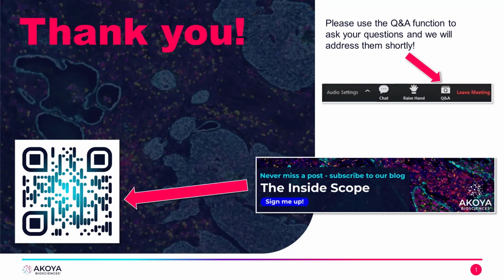Can we quantify expression of markers? Yes, so you're able to look at not only how they're expressed, but also relative expression. If you look at how the output is done, you not only get your relative data in terms of your X and Y, which is lost in a lot of other types of analyses, but you're also able to see what the relative intensity is of your different markers across your different cells. So in the example I gave during the talk, we had 63,000 different cells, and you're able to get your expression for each of those cells, for each of the 36 markers, for example, that we presented.